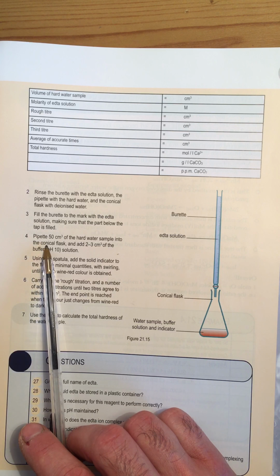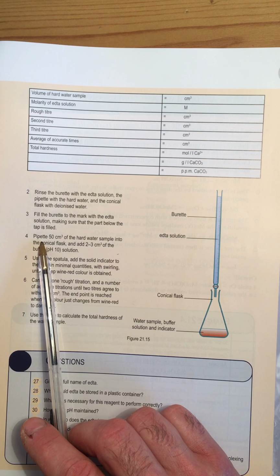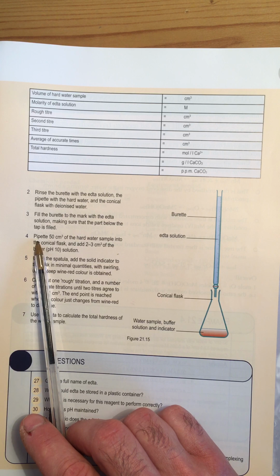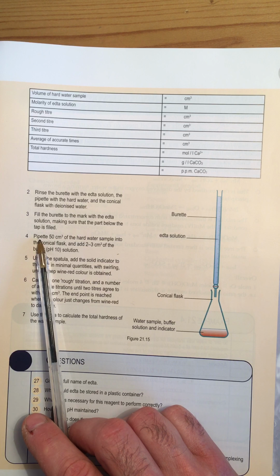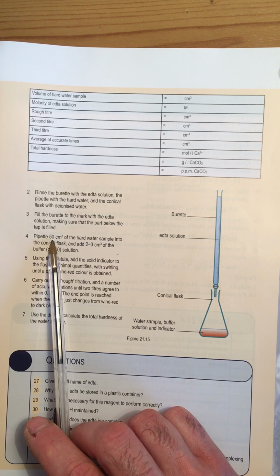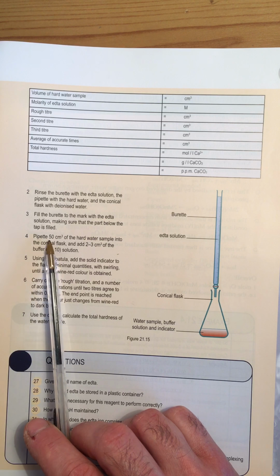Now, the solution that goes into the conical flask, there are very few cases where you don't use 25 mLs. As you remember, all the pipettes that we have are 25 mL pipettes, and normally you just transfer 25 mLs into the conical flask for all titrations. Here is one example of where you use 50 mLs rather than 25. You don't have to remember that, but just if it comes up in the exam, just be careful that when you're writing down the volume for what's in the conical flask, that it's 50.